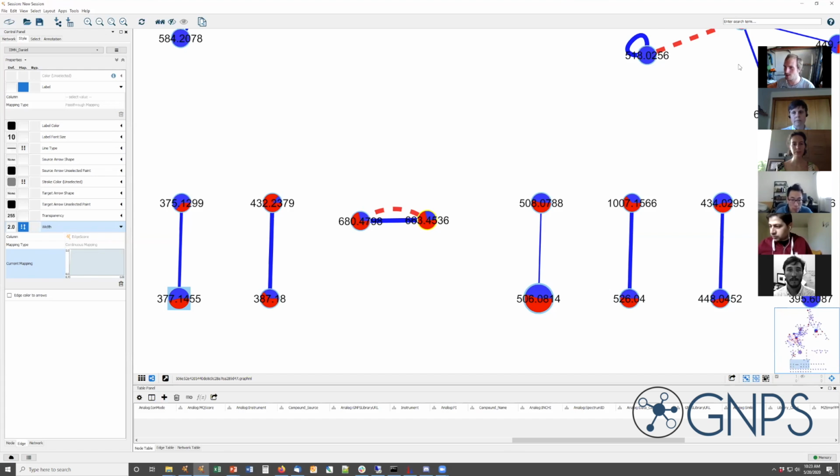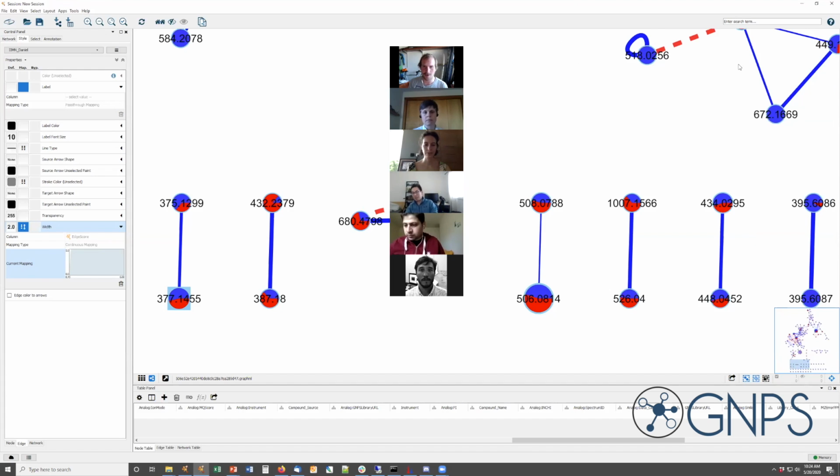All right, does anybody want to share their networks and what they found?